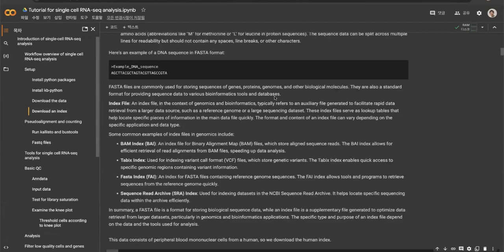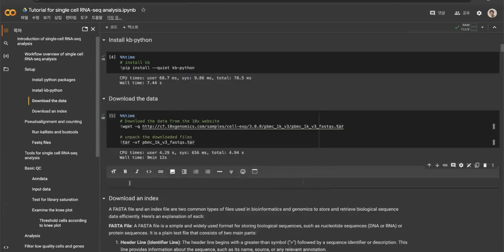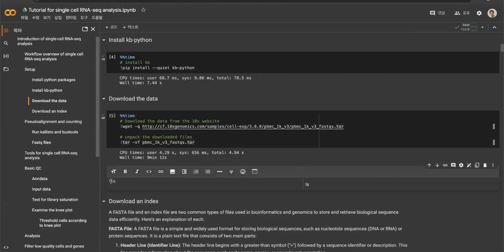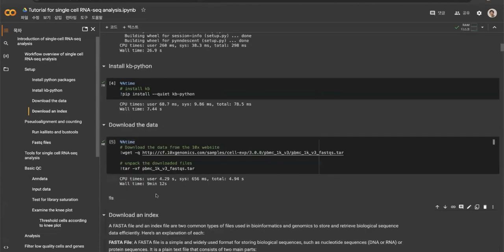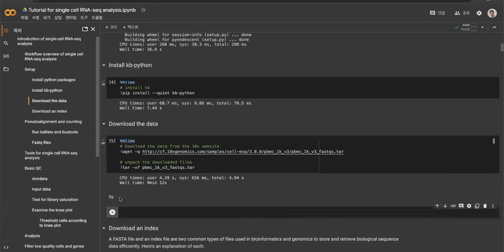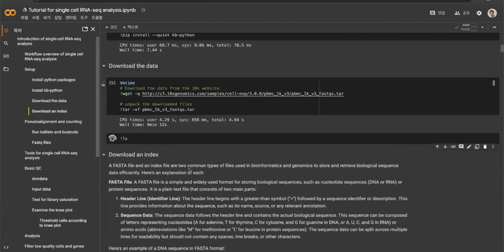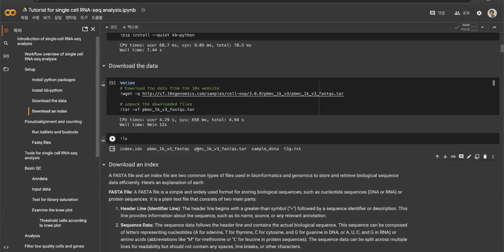What I want to see first, a little bit dragging, is whether the data is really stored in here. You can just type ls, which is the command to, oh, sorry. Type ls. That will show you the files in here.